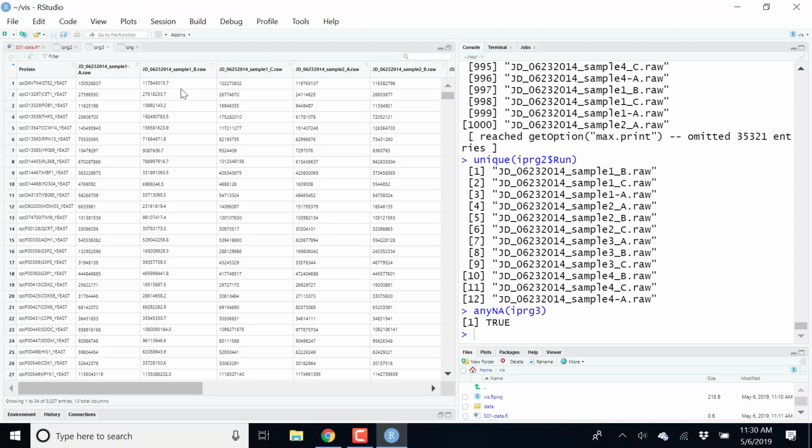here, there is this protein column that's still there, so we'll have to handle it. Oh, by the way, very often in these wide datasets, I forgot to mention, we would not have this column with protein names. We would use the protein names as row names of this matrix or data frame. We want to focus exclusively on the quantitative data.